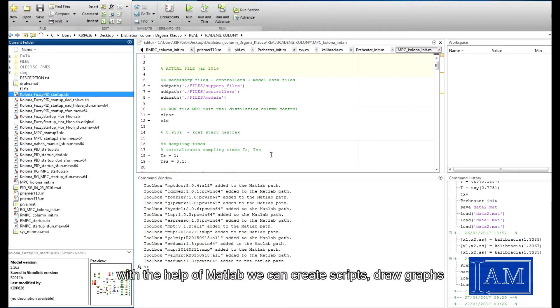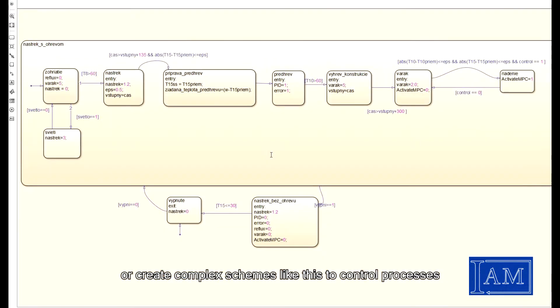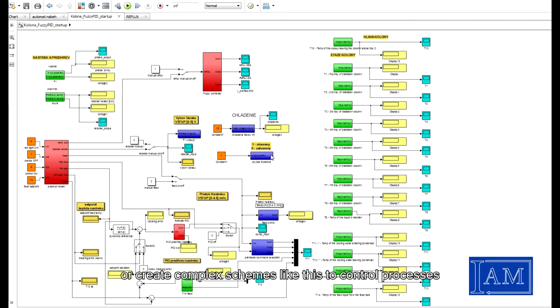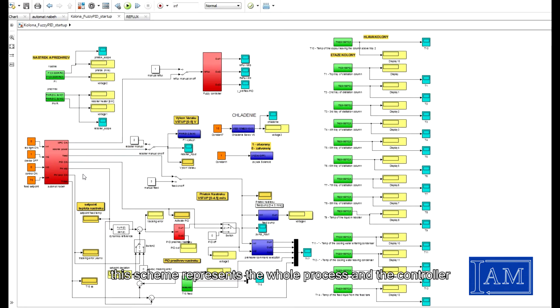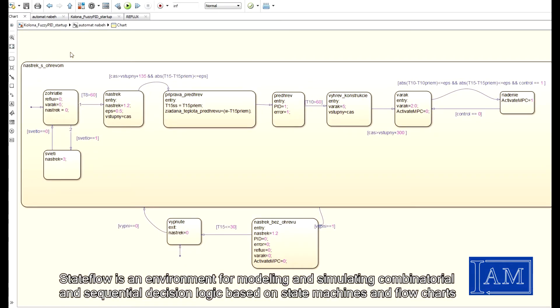Or create complex schemes like this to control the processes. This scheme represents the whole process and the controller itself. Stateflow is an environment for modeling and simulating combinatorial and sequential decision logic based on state machines and flowcharts.